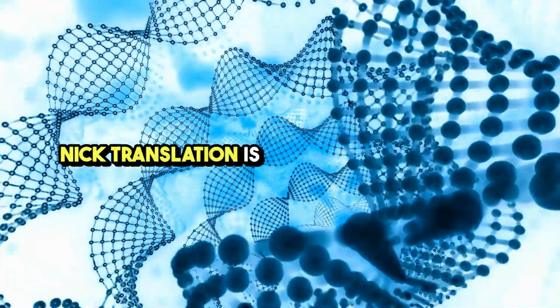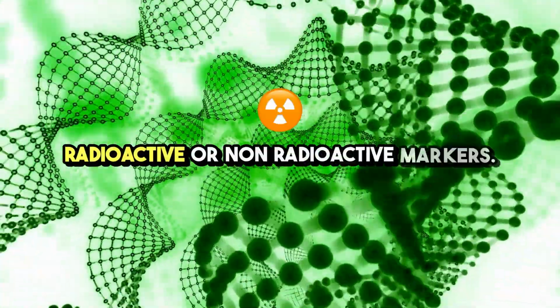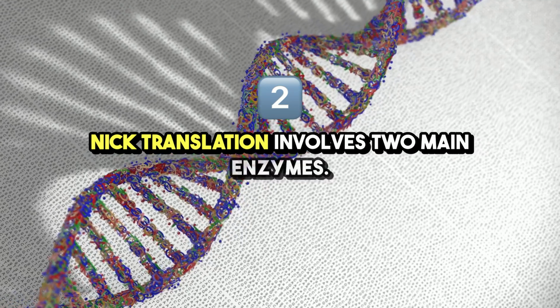Nick translation is a crucial technique in molecular biology used for labeling DNA with radioactive or non-radioactive markers. Let's explore how it works and its applications. Nick translation involves two main enzymes.